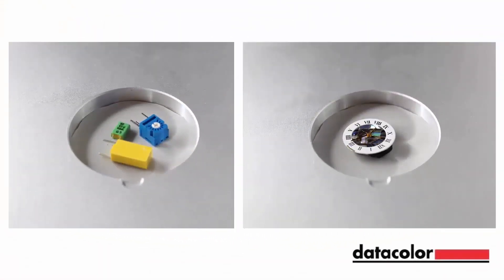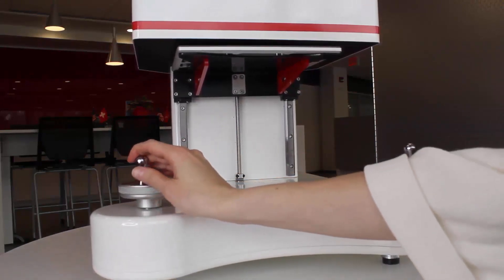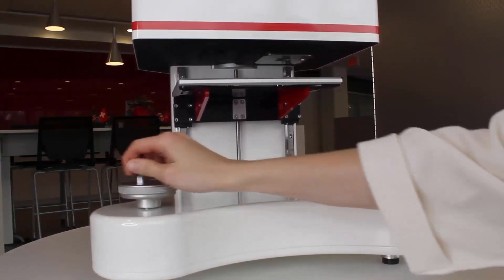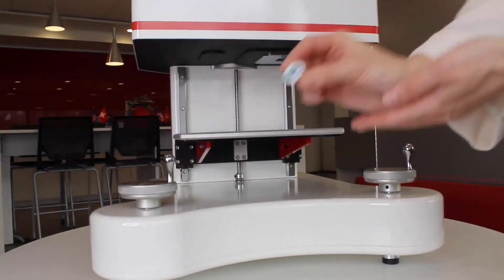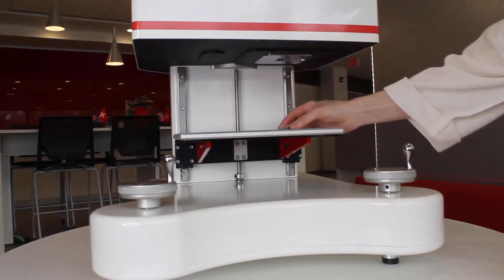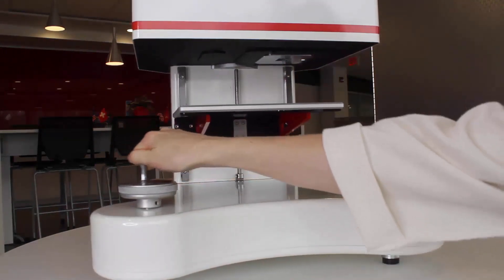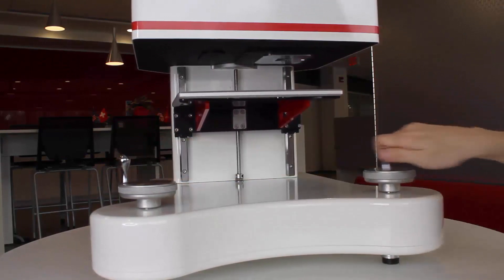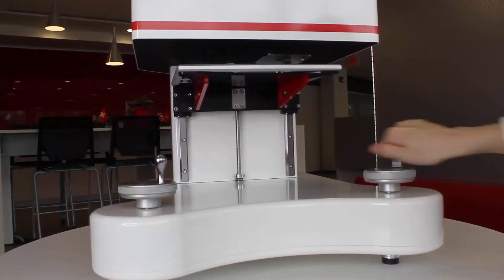This instrument is ideal for small parts or samples that would be easier to measure resting flat during an evaluation. To demonstrate the functionality, we will be measuring electronic and watch parts. Lower the sample tray by rotating the coarse dial until the sample tray is visible. Place the samples inside the inset of the tray and adjust the coarse dial until you are three quarters of the way up to the aperture plate, then switch to the fine dial for the remaining quarter until the sample is in position for measurement.